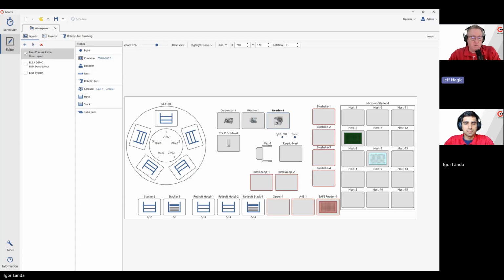Yeah, this really saves a lot of time on getting new workspaces in, workspaces that you had in the past that you really wanted to utilize or you liked. You can put all that information back in a quick little import dialog like we showed you, and it really makes things happen quickly. From transfer to maybe an older system that when you're updating, you can import that workspace database so you don't have to recreate this entire model again for an update on your software.